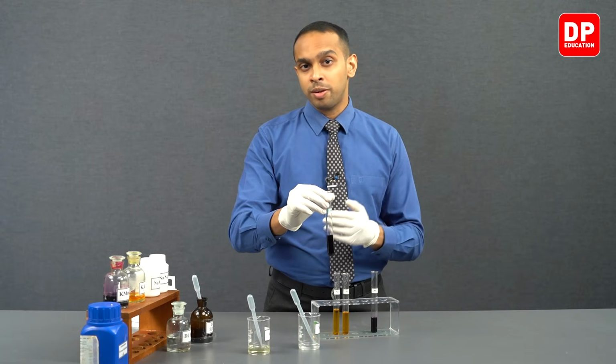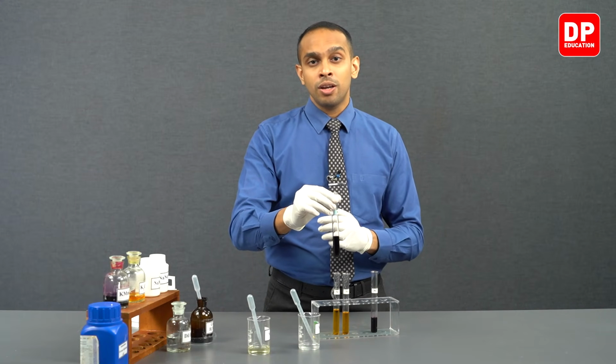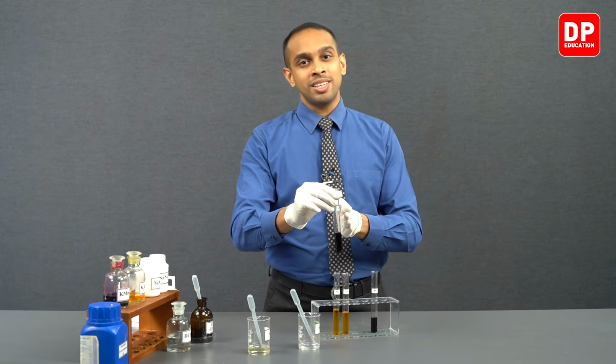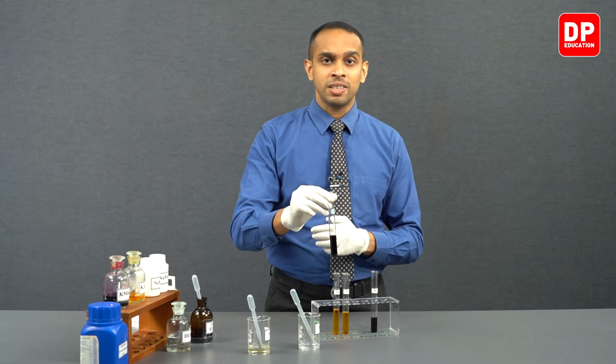If acidified potassium permanganate is reacted with something that can get oxidized, acidified potassium permanganate will change its color from purple to colorless. And you will not see that observation here as nitrate ions cannot be further oxidized.